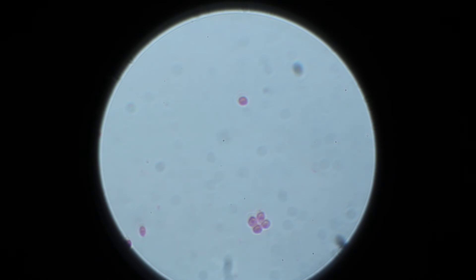And now we're pretty much through it, so we're starting to back up. We'll know we're in the center when the gap between the cells is the smallest — like right about there. Seems to be fairly clear right here at that gap. We've got some nice sharp dark lines around the spheres, just delineating that little square gap in between the four cells.